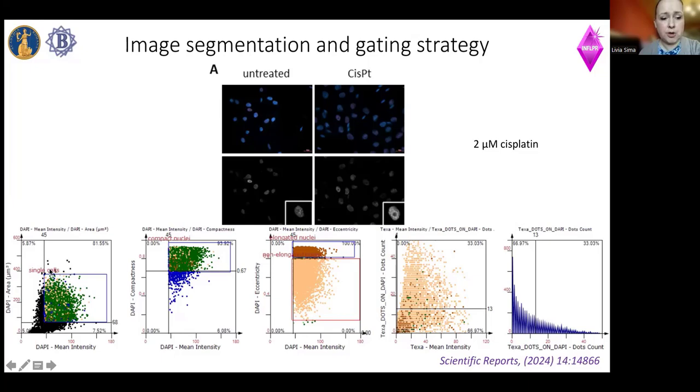We have set up the thresholds for every parameter, and also we have encircled the cells that correspond to single nuclei in our samples. From these events, we have then selected compact nuclei by choosing on the OY axis of the next scattergram DAPI compactness.